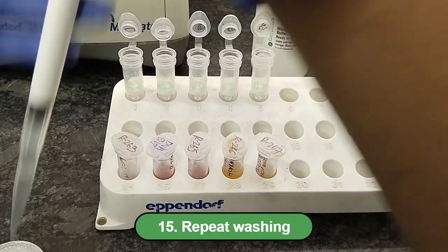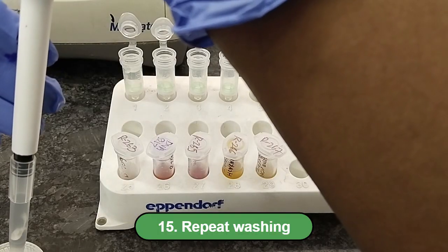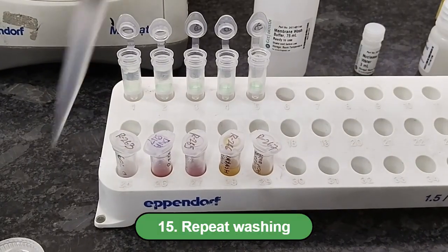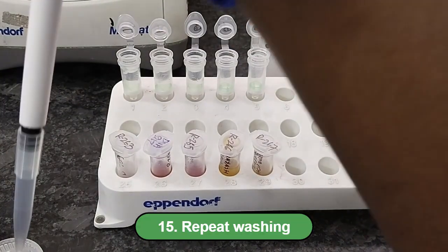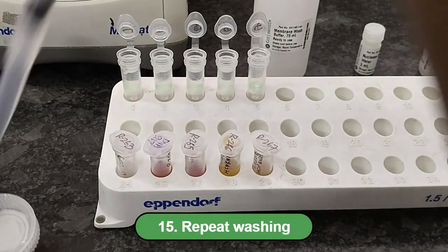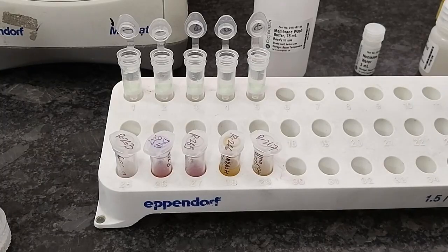You can centrifuge it for 30 seconds or for 1 minute. After addition of membrane wash buffer is done, it is subjected to centrifugation for the second time.